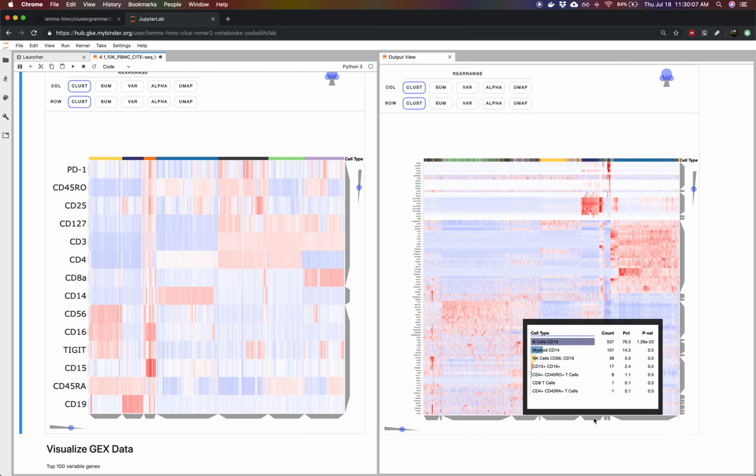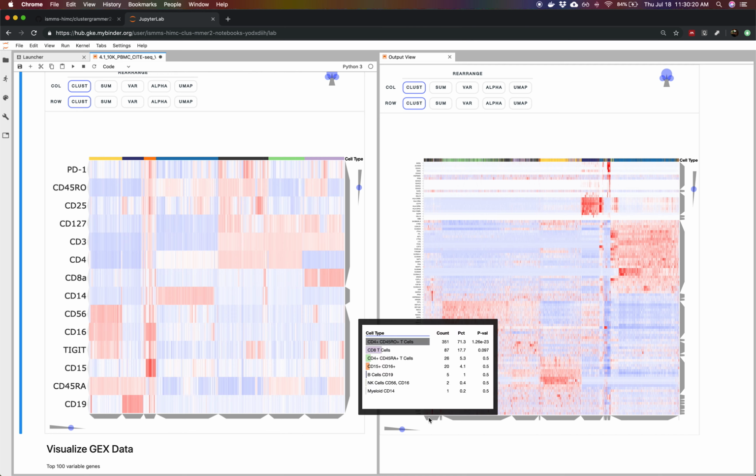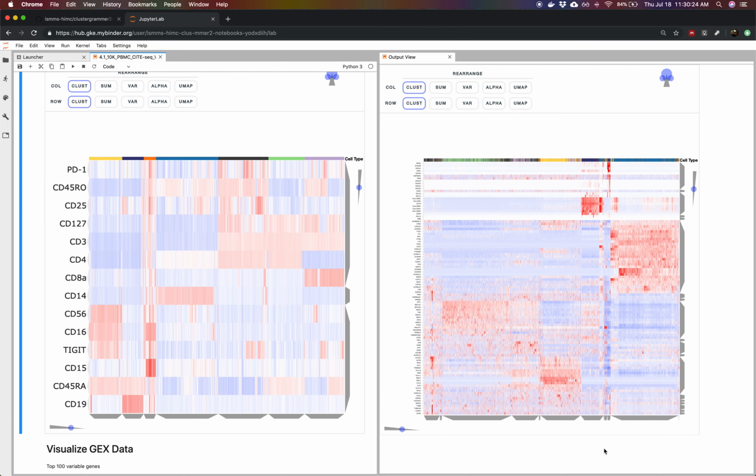This can help us identify cell types or cell states, for instance, that are not captured at the protein level but are captured in higher dimensional gene expression space, or it might point to certain advantages or disadvantages you have in the two different measurements. You might want to define your cell type based on surface marker and then transfer that to gene expression, or you might want to do the opposite, define your cell type based on gene expression and see how well it agrees with surface marker space. In this case, we went from protein to gene expression, but you could do both.